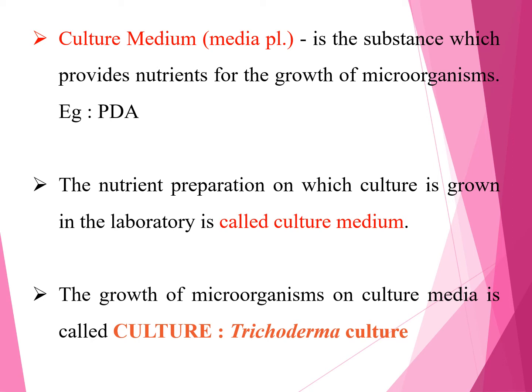The nutrient preparation on which culture is grown in the laboratory is called culture media. The growth of microorganisms on culture media is called culture. Like a colony of Trichoderma can be called a Trichoderma culture.